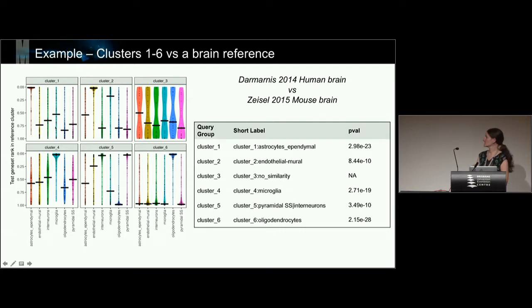Here's the full example. Obviously you do all the clusters at once, because why not? The output of the Celaref here would be this plot and a label generated for each of the clusters, and a measure of the confidence in that. Okay, and I'll go through some examples.